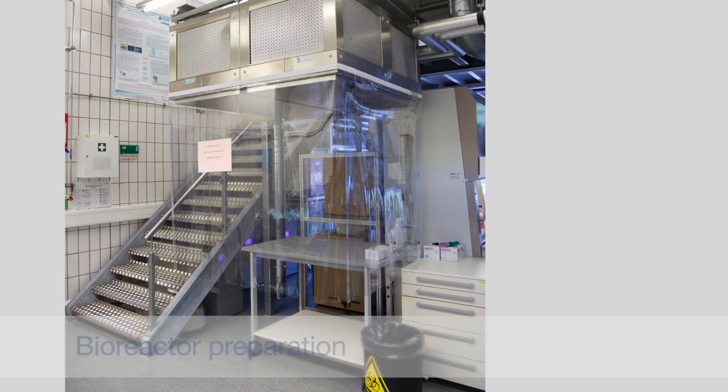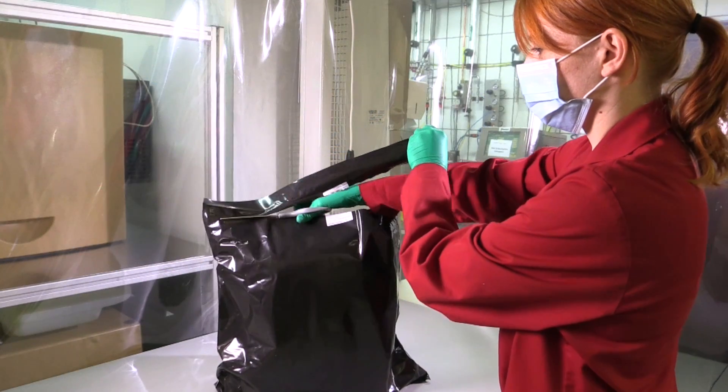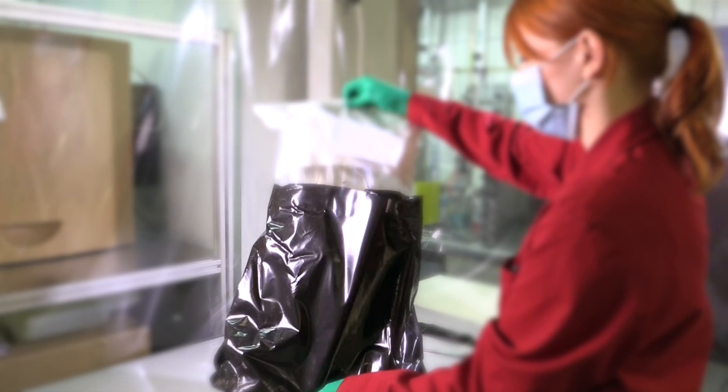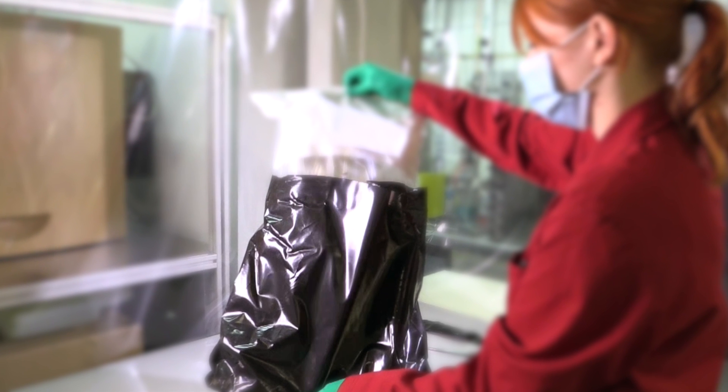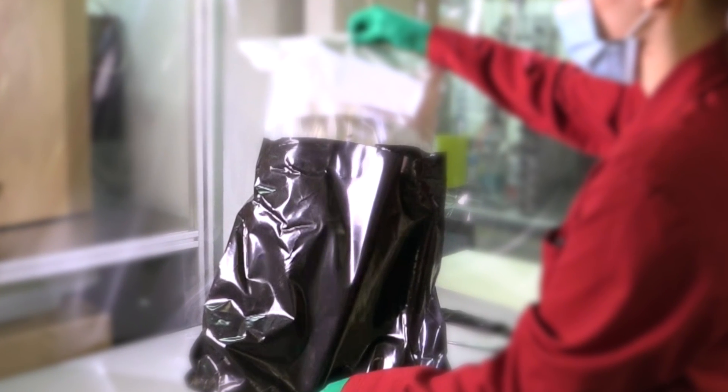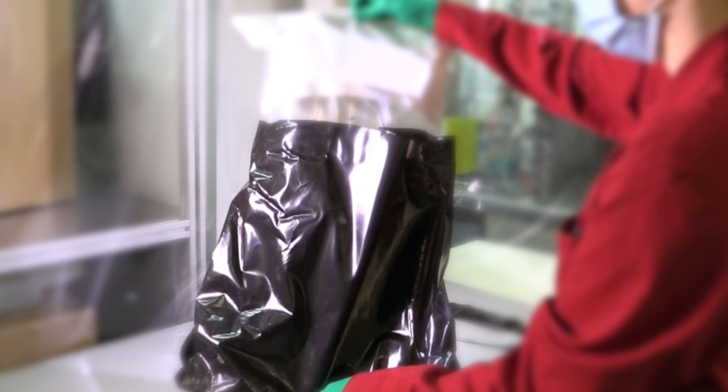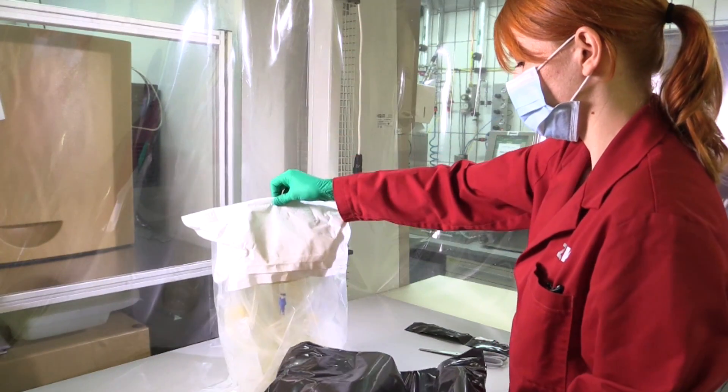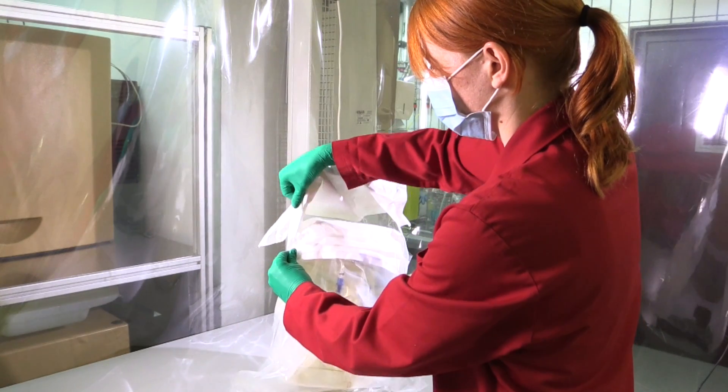Both the bioreactor preparation and the subsequent inoculation take place in a special laminar flow cabinet. The pre-sterilized vessel has three layers of packaging. The first layer is black and protects the vessel from dust and especially from light, which is required to avoid photo bleaching of the optical sensor patches. The second and third layers are transparent and are the sterile part of the packaging.